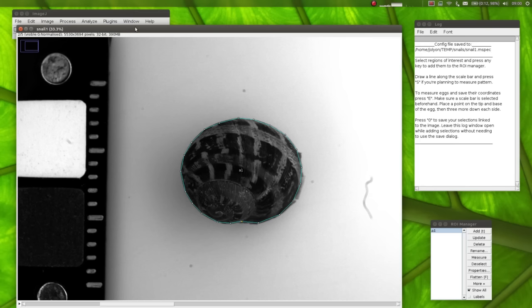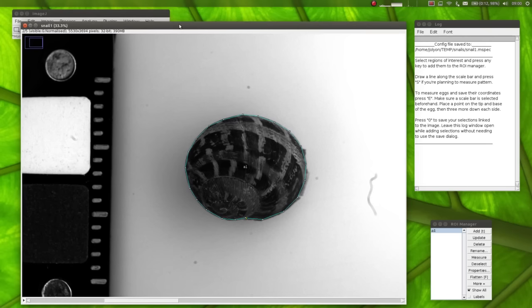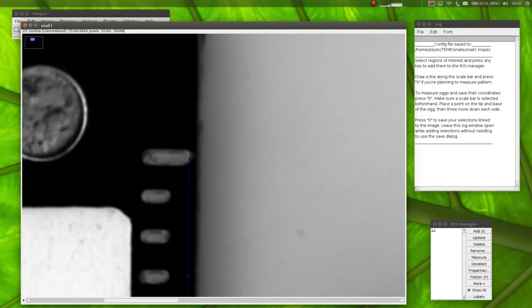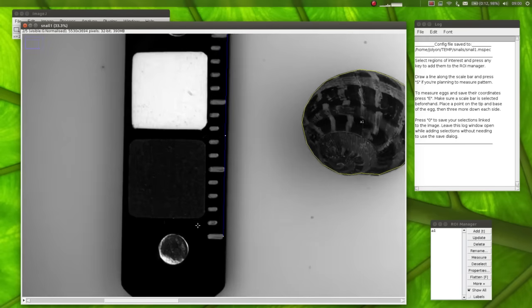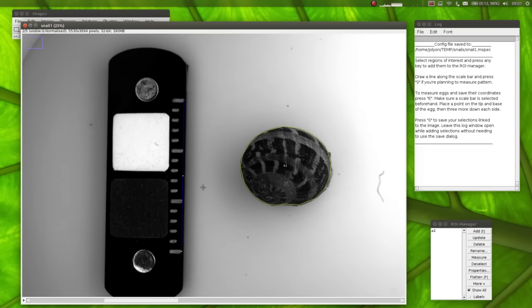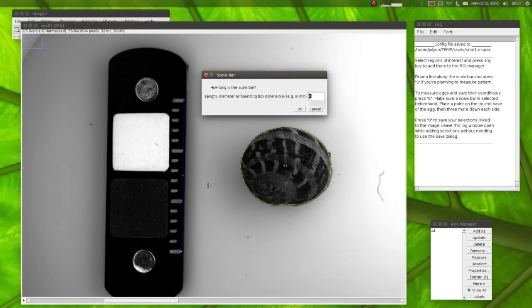That's nice and easy. Next, I want to select a scale bar. I'm going to be measuring the pattern in this image. So it's important when you're measuring pattern between images that every image is scaled to exactly the same number of pixels per millimeter or per meter, whatever the unit you're using. So I will just draw a line along the scale bar here, using the plus and minus keys to zoom in. It zooms in and out of wherever you have your mouse pointer at the time. Now that I've selected the scale bar, I press S on my keyboard and tell it how long the scale bar is. So this is 30 millimeters long.